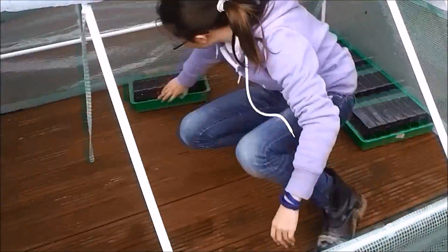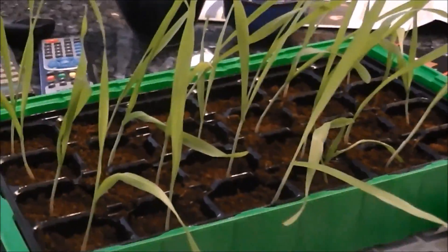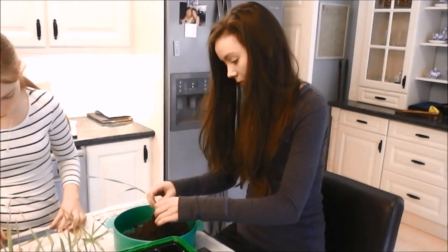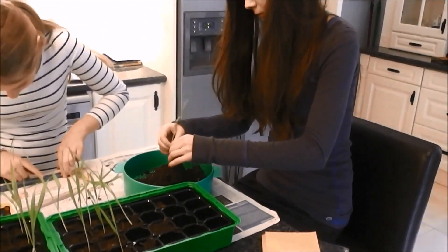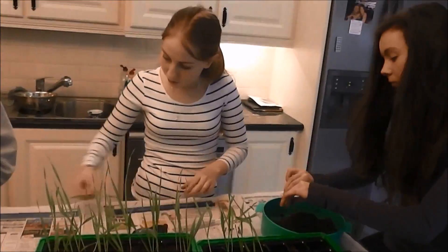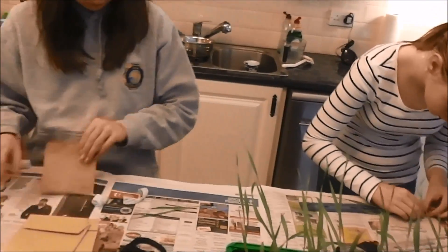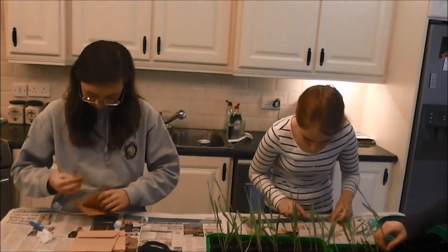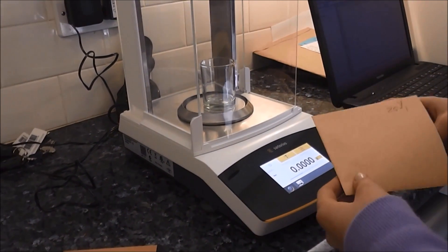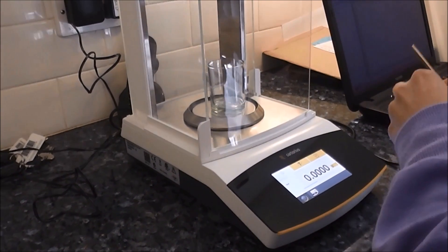We then conducted small-scale field trials, where treated seeds were grown in small growing pots in a greenhouse. After growing for 2 weeks, we harvested the young crops. Lengths were measured and crops were dried in order to remove moisture before being weighed.